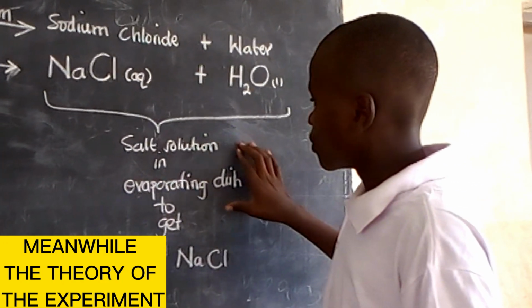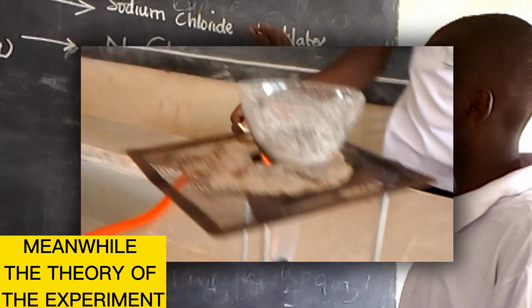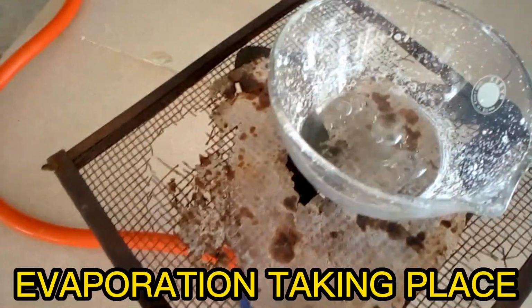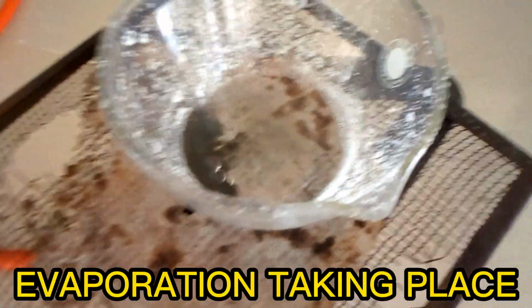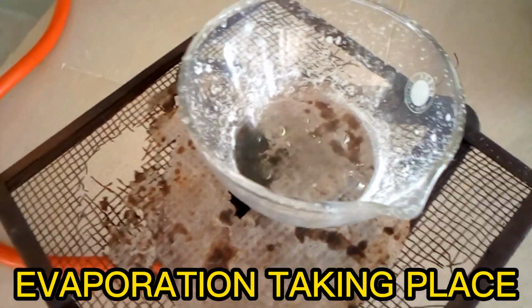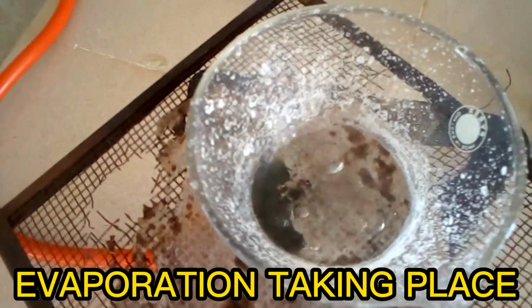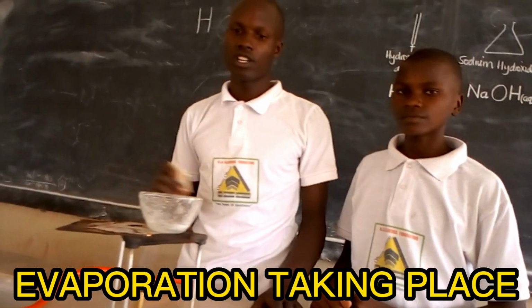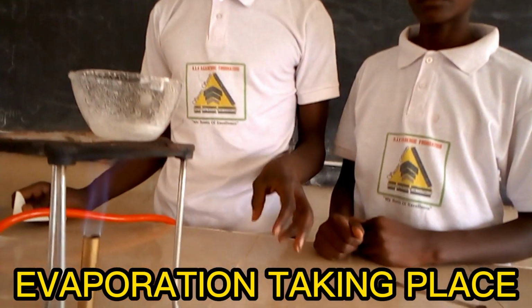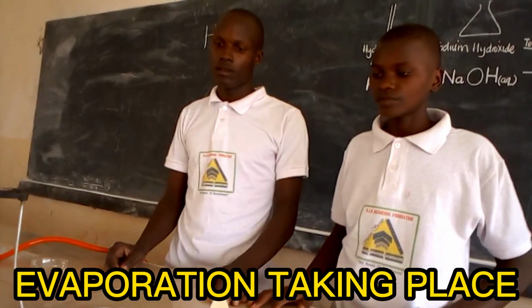So that we can evaporate the water and remain with the sodium chloride. As you can see, the solution is at half of the evaporating dish, and you can see the crystals on the wall of the evaporating dish. This means that the crystals are being made and the water is being evaporated out. We evaporate this one to dryness as the first method, whereby we shall evaporate the other one to halfway. We shall leave this evaporating dish to cool because we want to avoid burns.